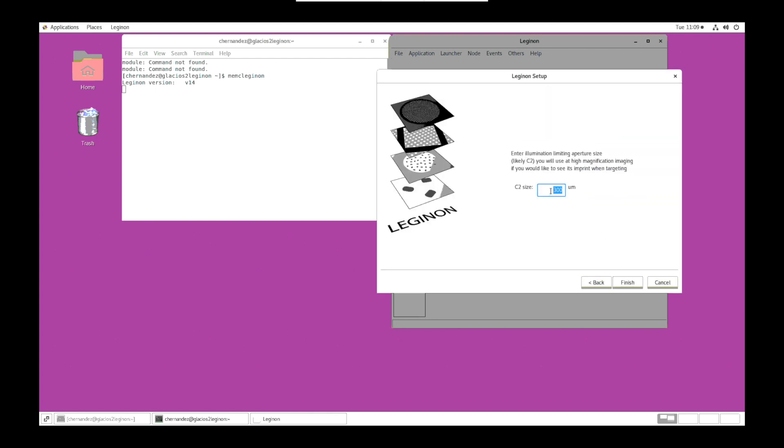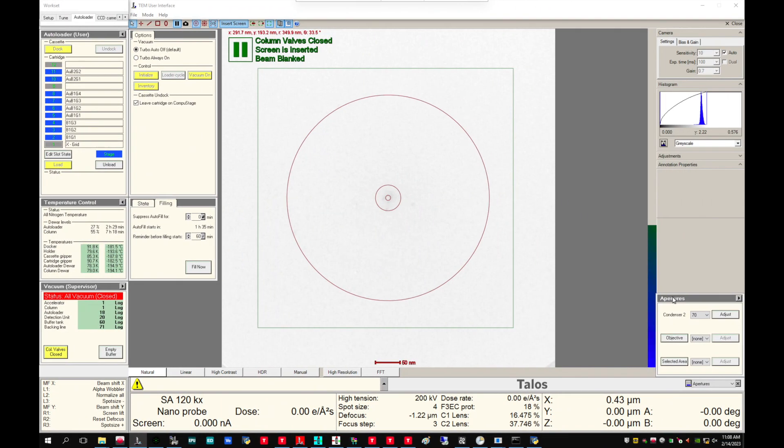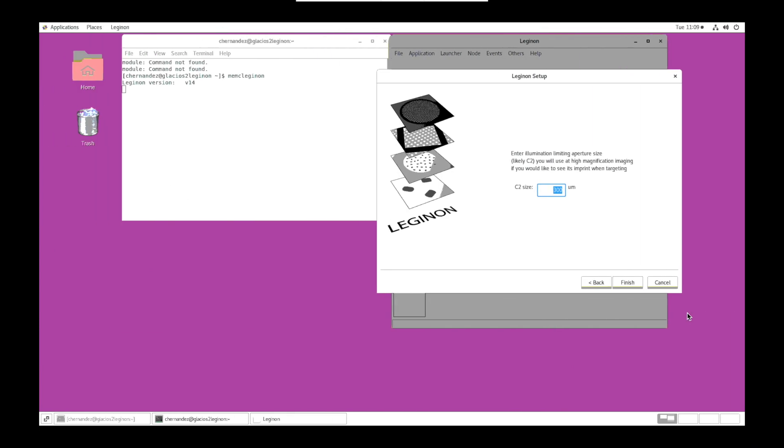Our C2 size can be confirmed on the microscope PC under the Apertures tab. Once that's edited, you can then click finish.